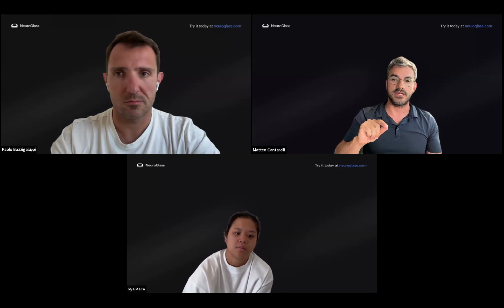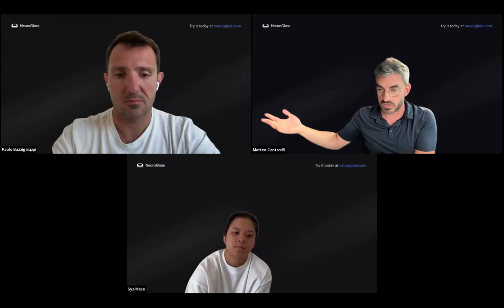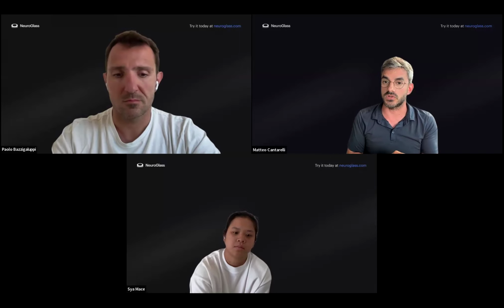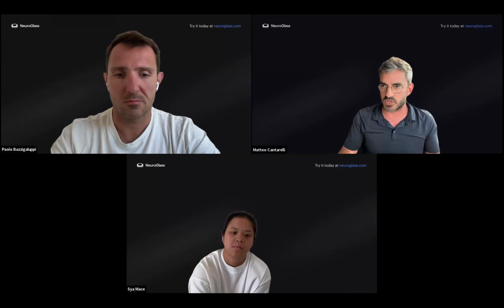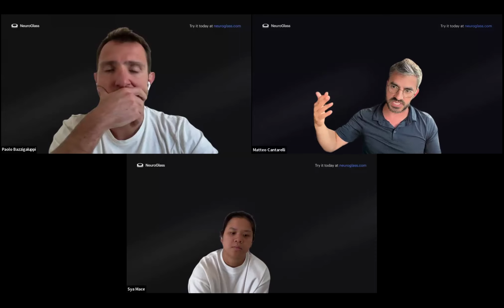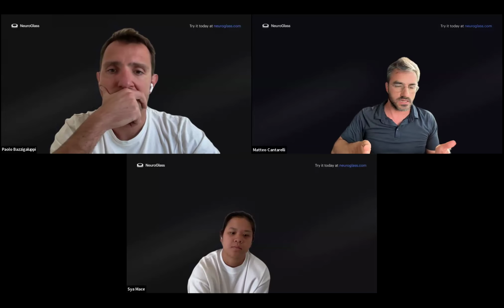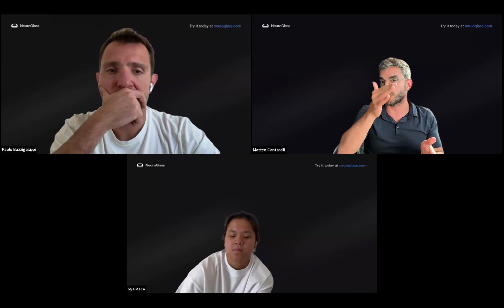You would create a task, select the ROI, and it would be an asynchronous job that would create the skeletons. But again, the experience for the user would be as simple as possible. You create a task, and then you receive notifications: this number of skeletons were created, and you will have all the skeletons ready to be proofread.